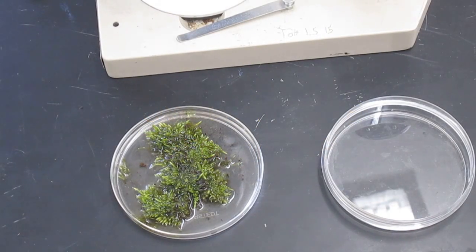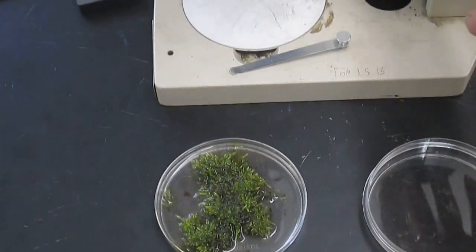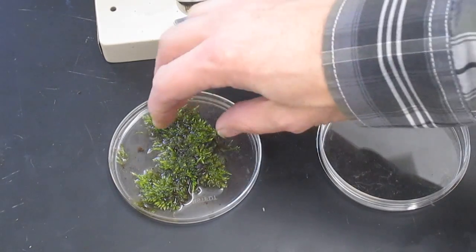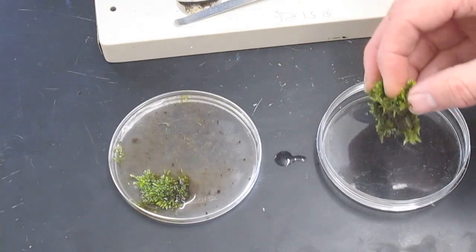To find tardigrades, you'll need some moss that has been soaking in spring water for about 24 hours, a petri dish, and a dissecting microscope. To get the tardigrades, it's really simple: get a piece of moss and transfer it over to another petri dish.